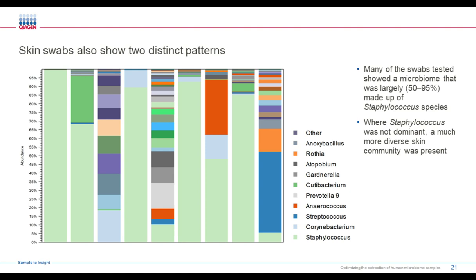Staphylococcus. And as I said, I wish that we had either patient data or demographic data to say something about whether or not the diverse sample type here has an effect on health patterns. But it's certainly interesting to see this pattern, simply that once the Staphylococcus is no longer the dominant species present, it looks like a very diverse set of skin flora arise.